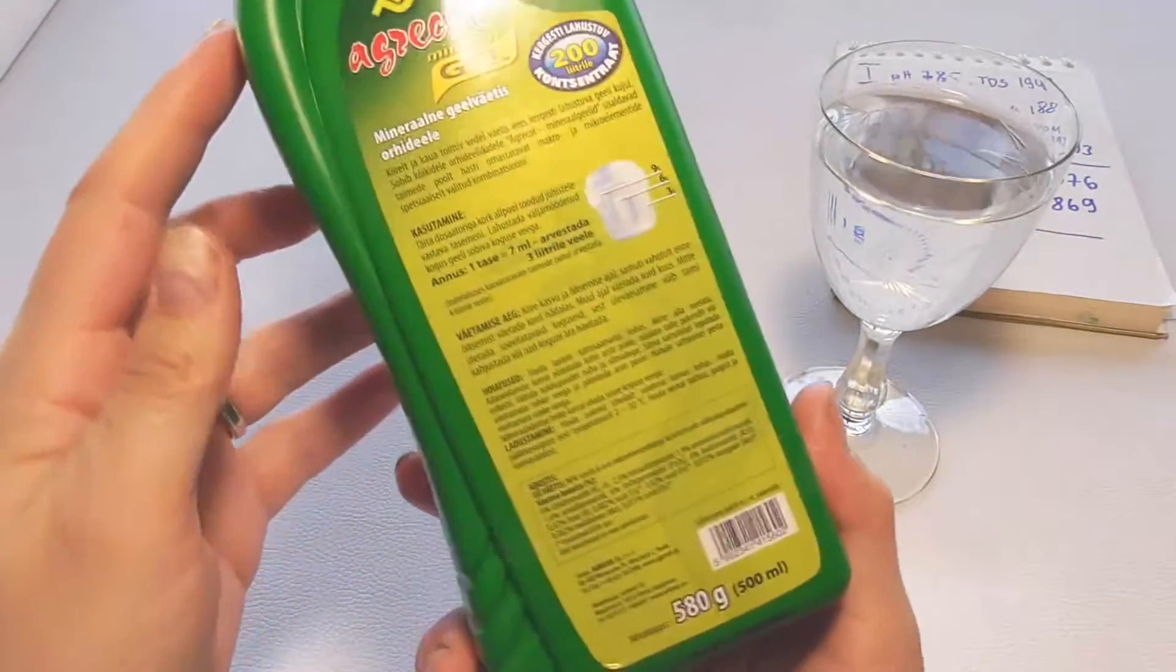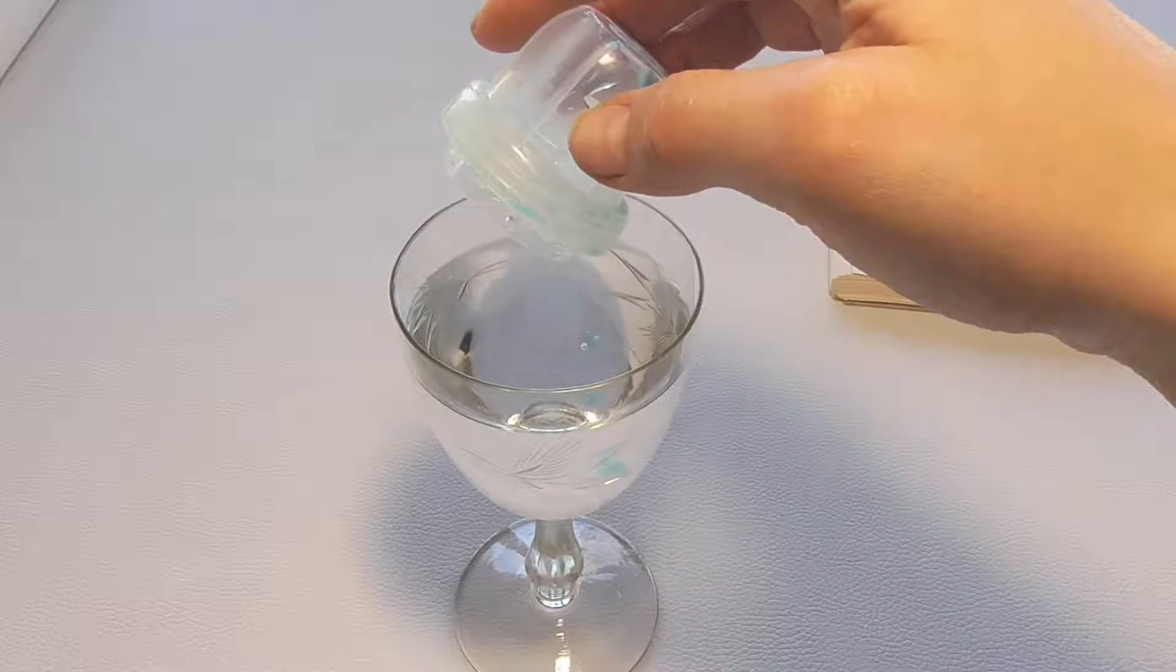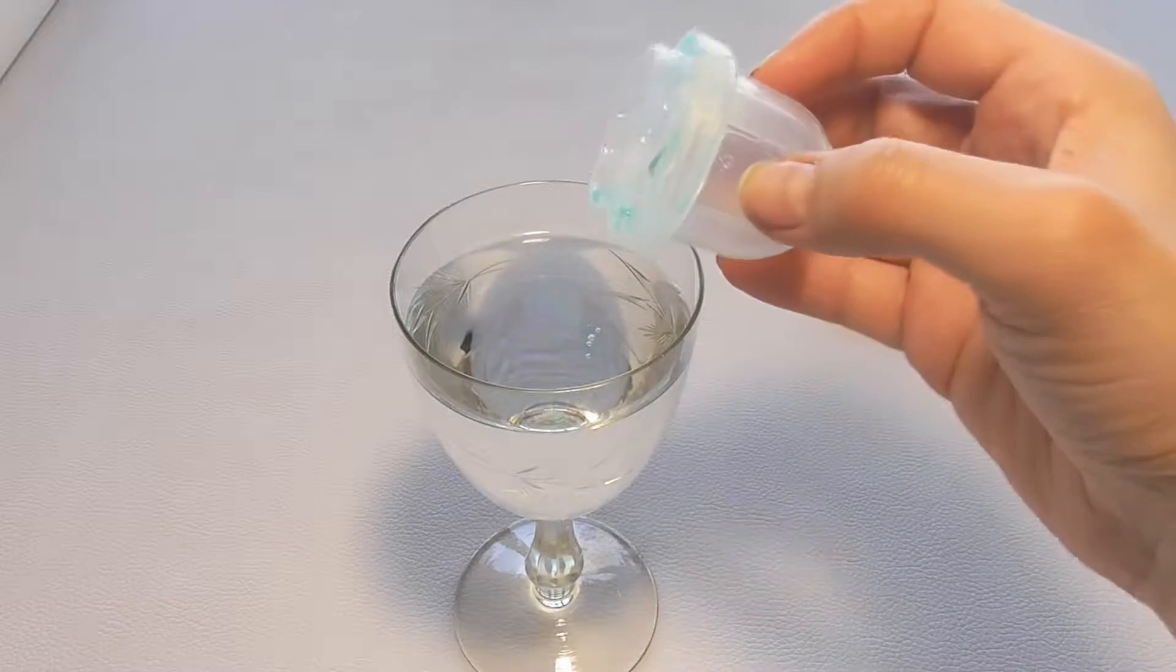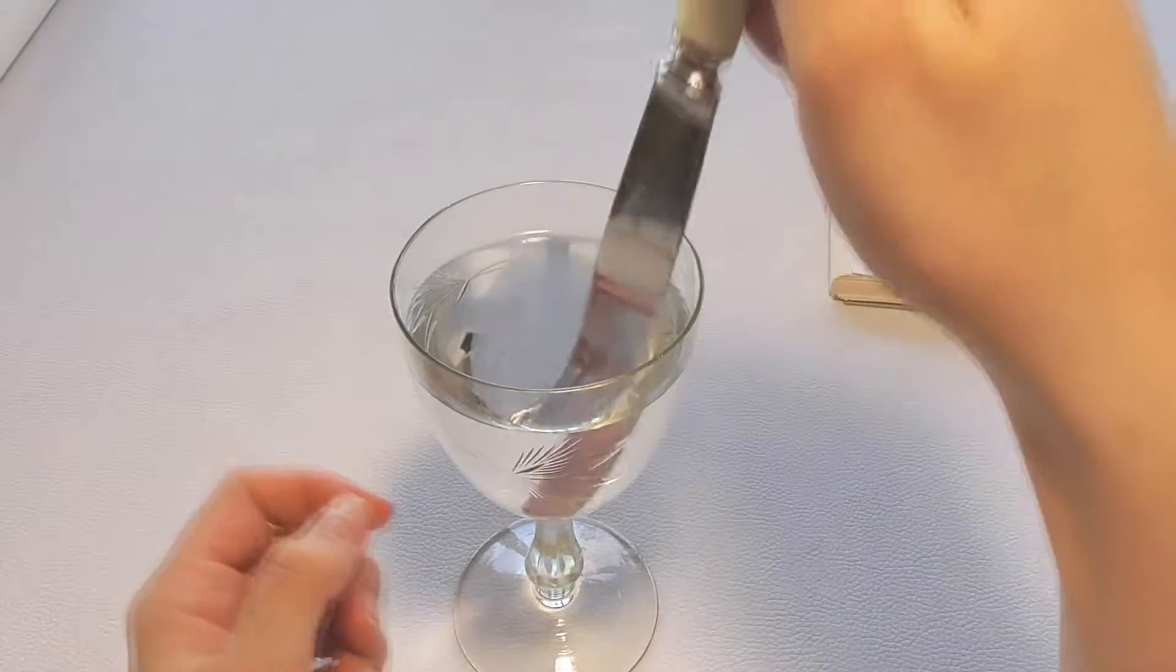Ideal measurement for any aquarium, the fishing industry, swimming pools, spa, school laboratories, food and beverage, drinking water and so on.